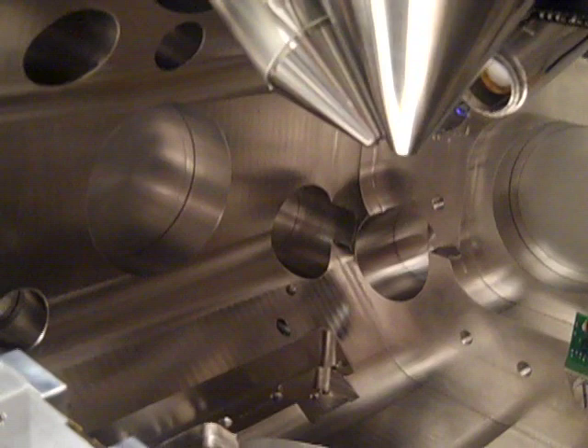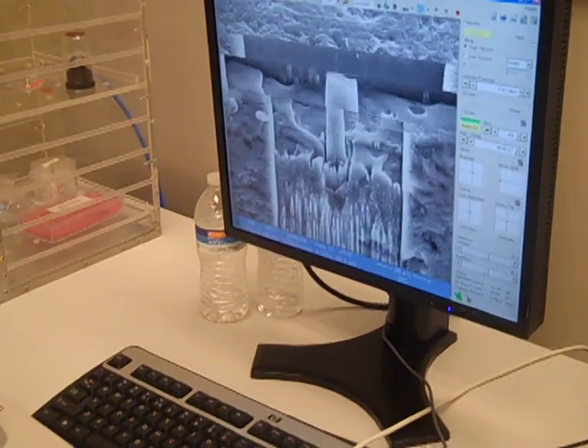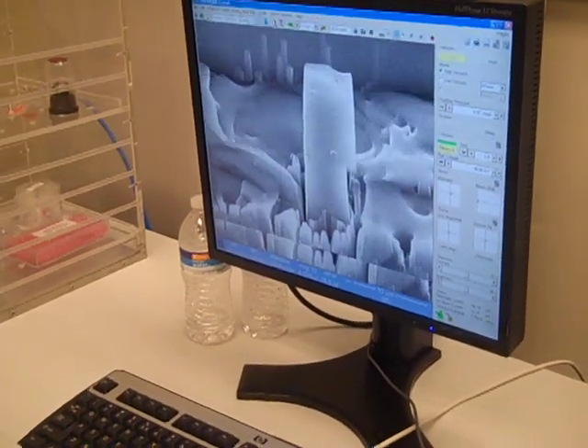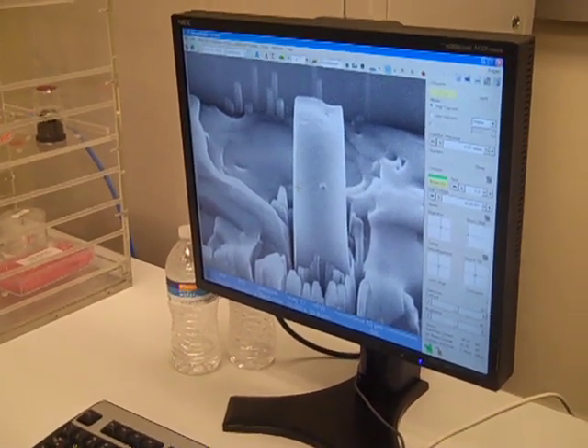And number two is that if you do it inside an electron microscope, you can actually see inside the material, because you're actually imaging through the material, and looking at how the defects interact and how the deformation actually takes place. So this is what's called an in-situ nano-indenter inside an electron microscope.